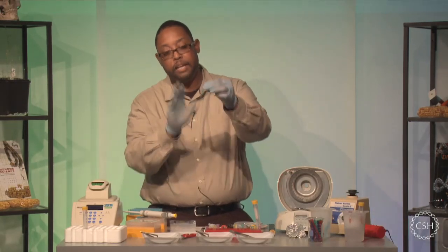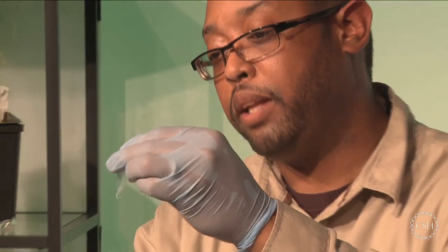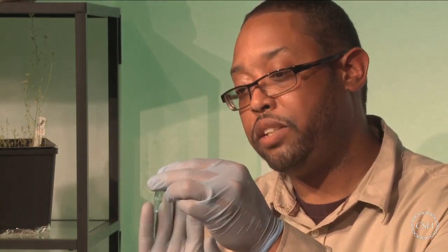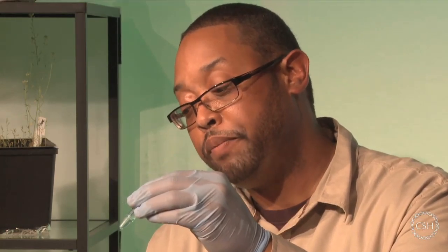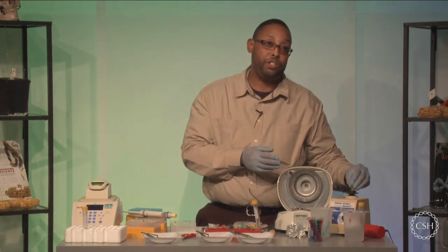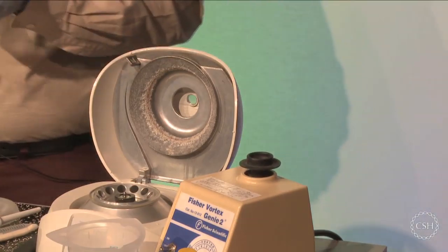So when I'm in here, I can either finger vortex, and I actually want to see that the pellet gets moved or dislodged. Okay. And it's actually starting to dislodge now. It may take a few taps, but there actually is a pellet physically in there moving around. Now, if you don't want to finger vortex, of course we can use the machine, which actually would be much easier to do overall. And that gets dislodged pretty easily.